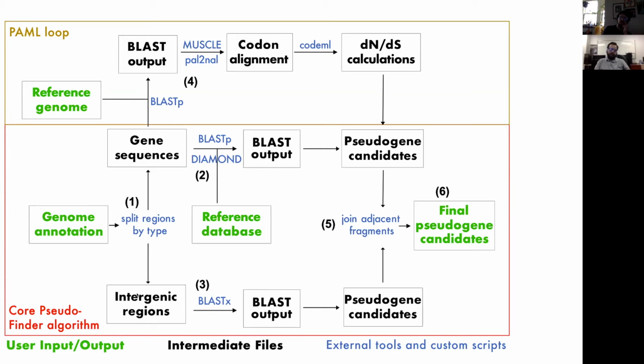One of the big problems that we see in the symbiont community is that a lot of the gene prediction software don't do well in predicting genes in genomes that have a lot of pseudogenes. So we might see really low coding densities, where we see gene sequences but also really big gaps in between genes, which is really uncommon for bacteria.